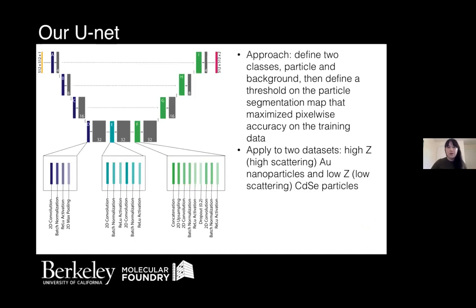We did build our own UNet. Our architecture strategy was to start with something that really resembled the original UNet and prune layers and the depth of layers until we had sufficiently reduced our trainable parameters such that we weren't overtraining on our data set, because our data set is not ImageNet.